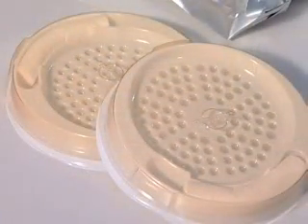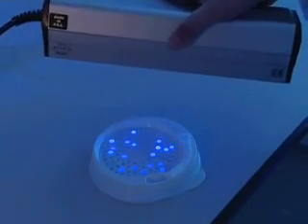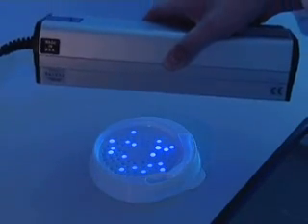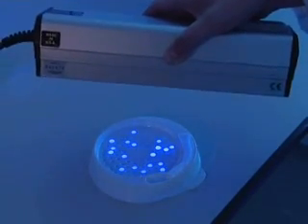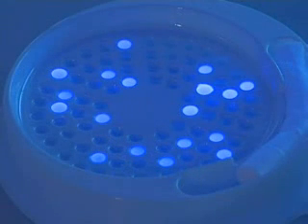Each plate counts up to 738 CFUs per milliliter and produces results in 48 hours. The MPN values generated by the SimPlate for HPC method correlate with the pour plate method using total plate count agar incubated at 35°C for 48 hours, as described in standard methods for the examination of water and wastewater, 19th edition.